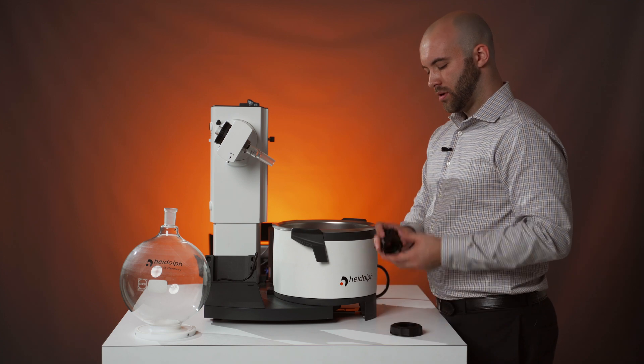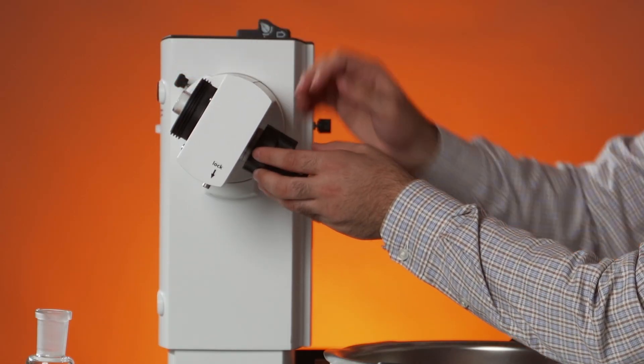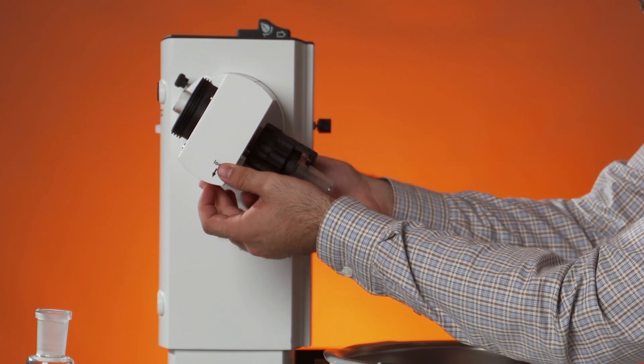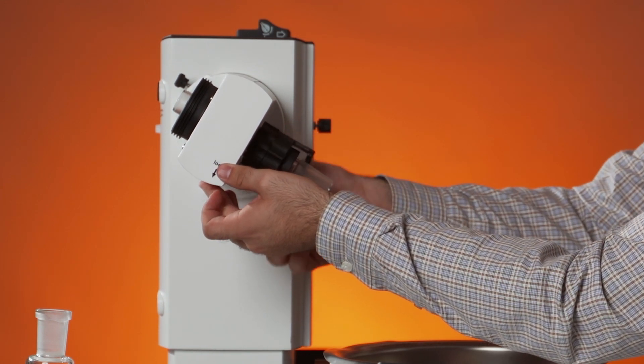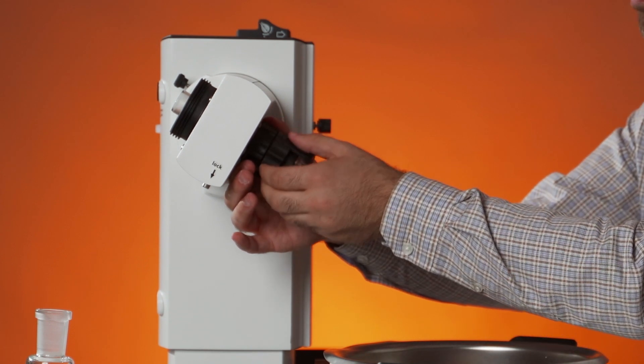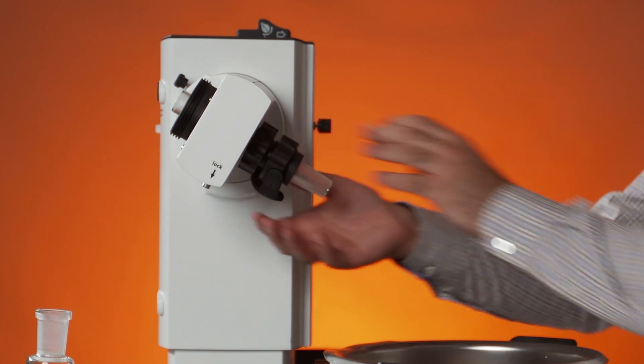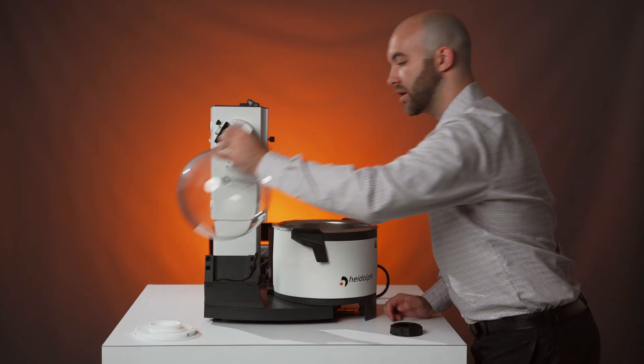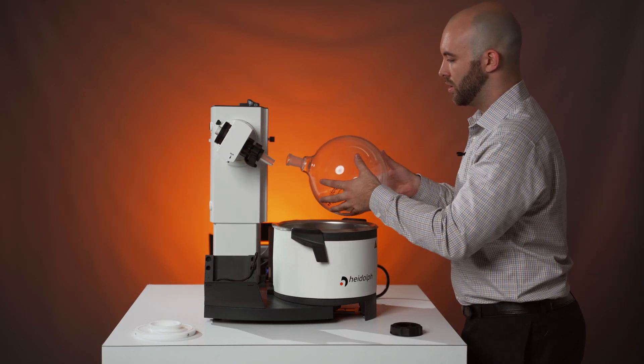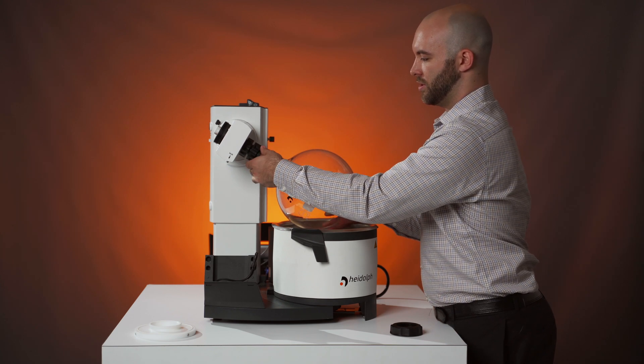After that, we can add back on the easy clip by holding this lock button. And then unscrew the clip portion of this two-piece device. Open up the swing and grab your evaporating flask, slide it over your vapor tube, clip down and tighten.